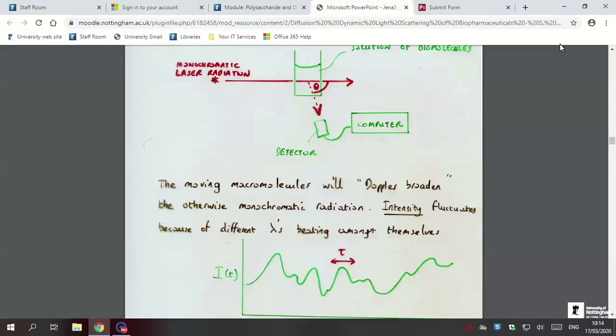It's like in the old days, now it's all digital radio, but in the old days, when you were tuning into Radio Moscow, not that you do that, but tuning into some Radio Bucharest or something on these big shortwave or medium wave radios, and then you find there's lots of other radio stations nearby, you know, Radio Mexico or something, and then what happens is that the two interfere because the wavelengths are very close to each other, and you get this upping and downing of the amplitude of the volume, and this is the Doppler effect.